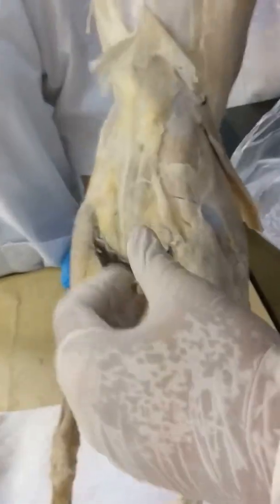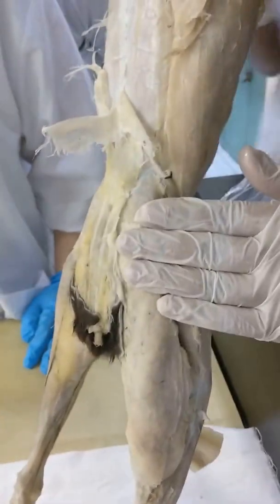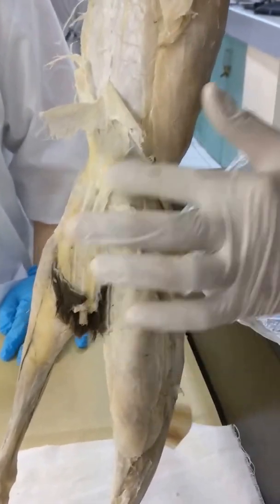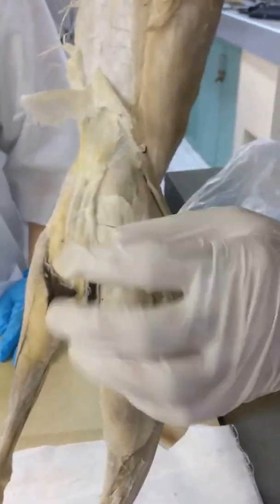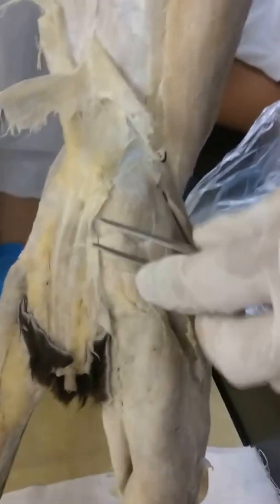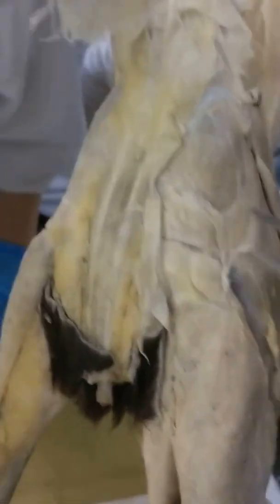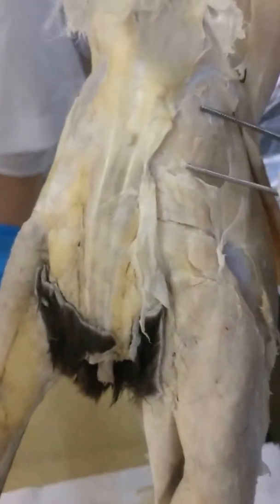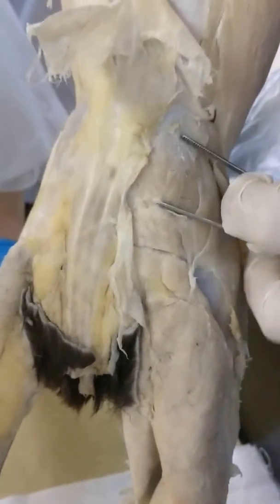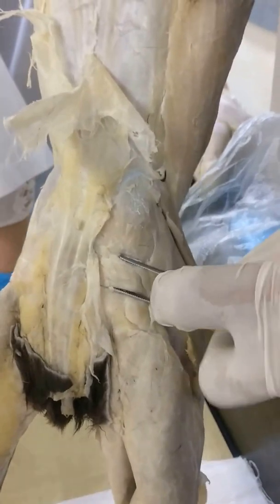This is the posterior side. What you need to do here is remove the fascia. After removing the fascia, try to find the divisions. You should see three muscles. This is the gluteus medius.